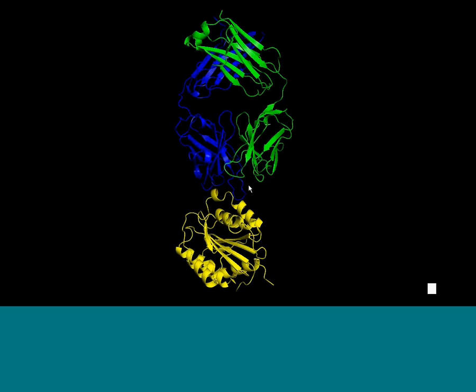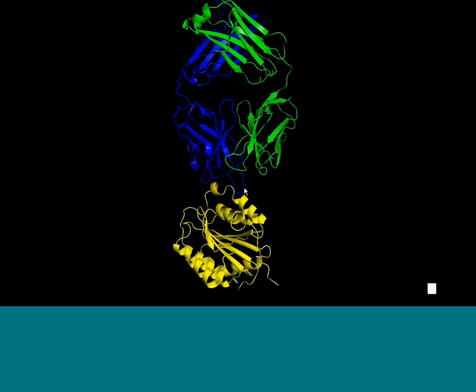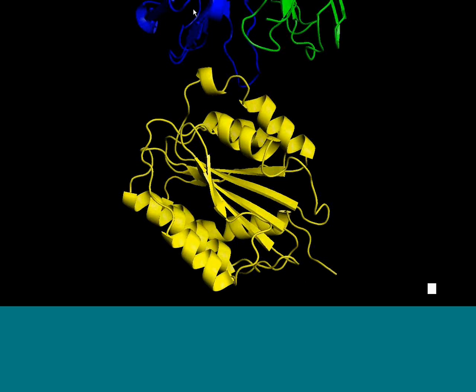So what we want to do is look at this interaction to determine the equilibrium dissociation constants, and then do more sophisticated mutagenesis studies and evaluate the thermodynamics of this interaction and see what is the contribution of each of the residues within this structural epitope. And so to define, first of all, what is the functional epitope, and then more carefully define the contribution of each residue. So that's what we'll be talking about here today: evaluation of what's going on in this interface.